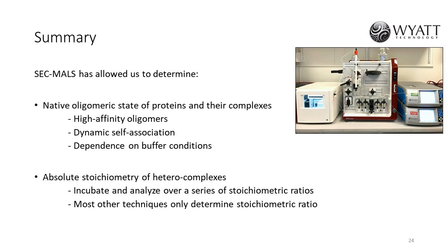We also, for studies not related to proteins, say sugars or small molecules which do not absorb at 280, find refractive index is the much better option to go for.